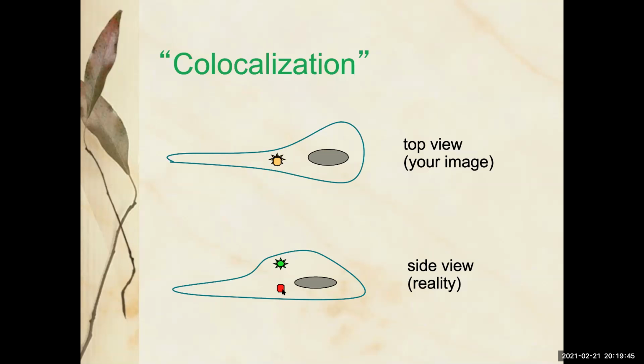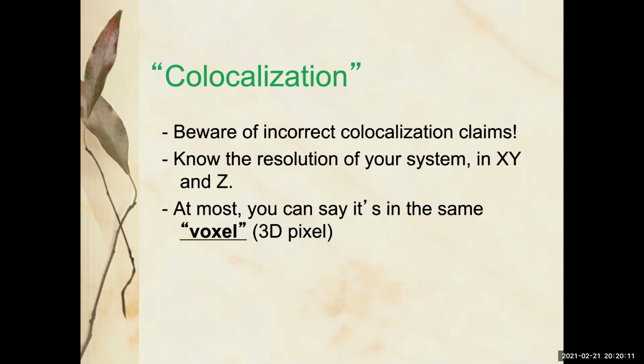And they're nowhere near close to each other in terms of size and cells. This is very far away from each other. They're clear across the cell. But you're sitting there going, oh, yellow, I see yellow, because they're in the same location. The answer is no. They're in the same what is called voxel. So a voxel, coming back to this here, a voxel is a 3D pixel.